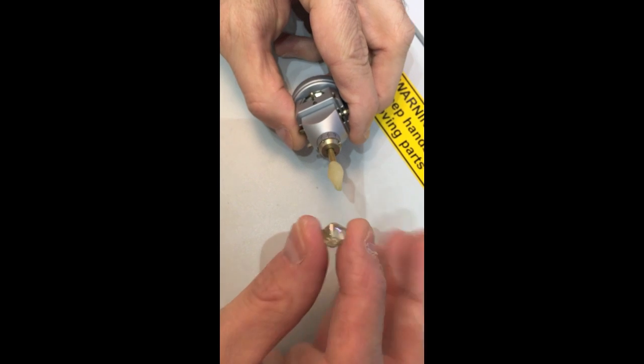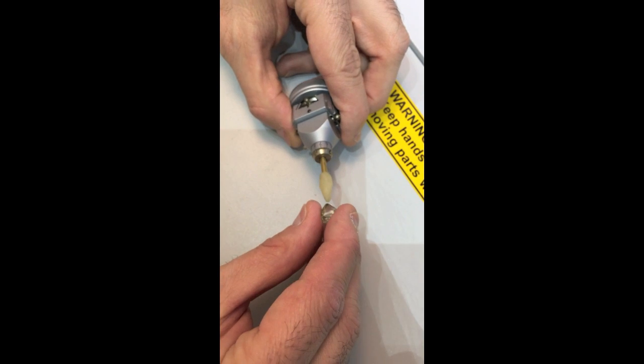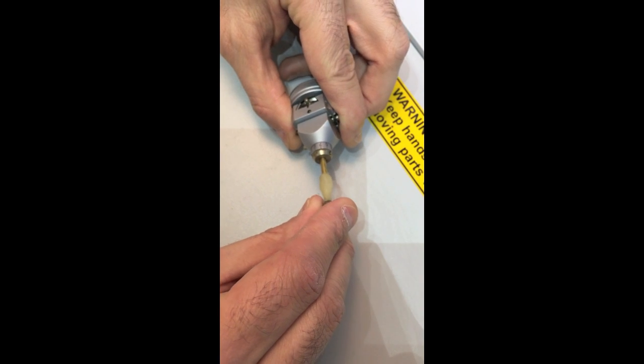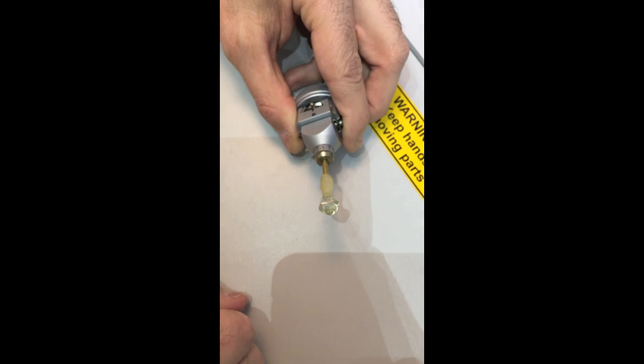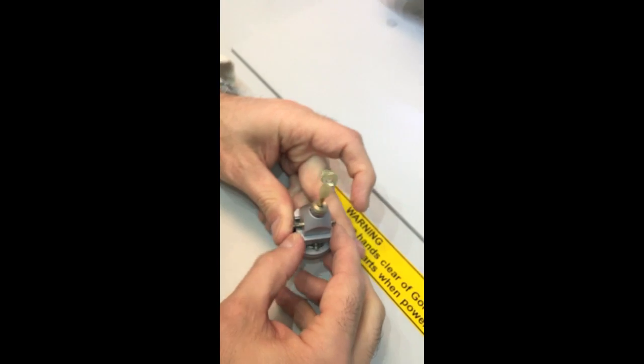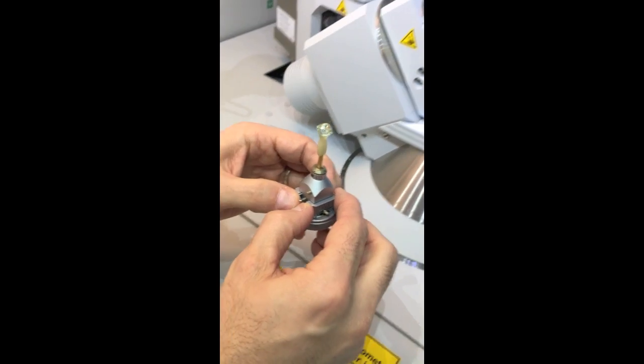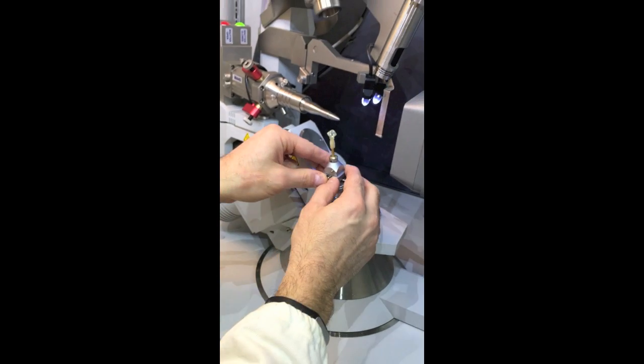So, I will show you now how we mount a diamond like this on a goniometer head. I have some wax here that fixes the diamond very well, you see. And now, I will mount this goniometer head on the single crystal X-ray diffractometer, like this.